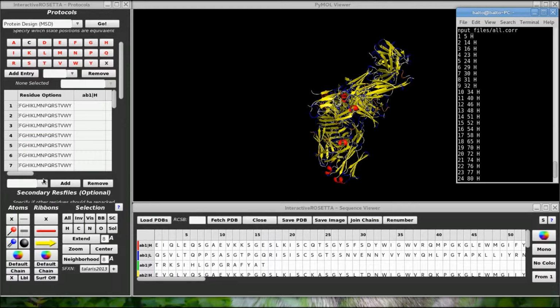Well, there's a shortcut. If you select a residue in the sequence window and then right-click on an element in the grid, it will automatically fill in that residue for you. If you select multiple residues, it will fill in all valid residues in the selection into the clicked cell and the ones underneath it. So what I am going to do is select all of these columns in the sequence window and then just right-click in each of these columns in the grid to fill all the residues in very quickly. I'll do the whole thing right now to show you how easy this can be.